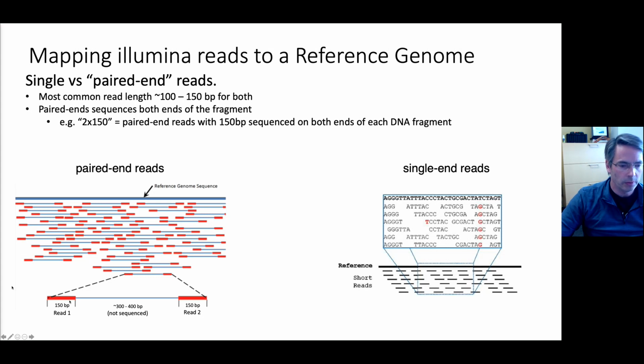So the value of having paired ends is that you can match read 1 to a place in the genome. And then even if that single read doesn't map to a unique spot, then you have a lot more information because read 2 is also trying to map to a unique spot, and you know roughly based on the preparation of doing the sequencing how much space should be between those, and that gives you more information about the unique location that those two reads might have come from.